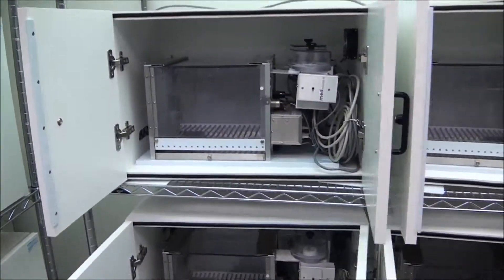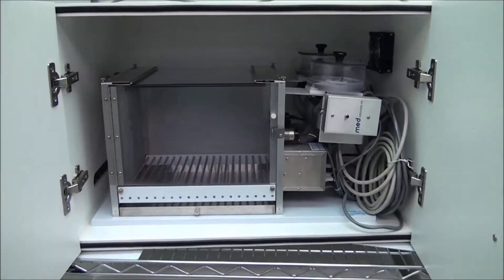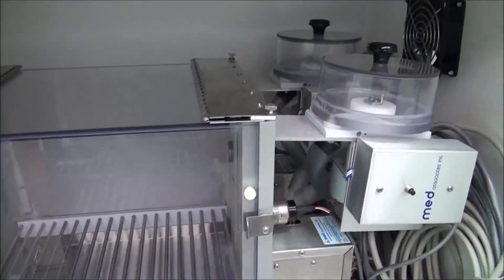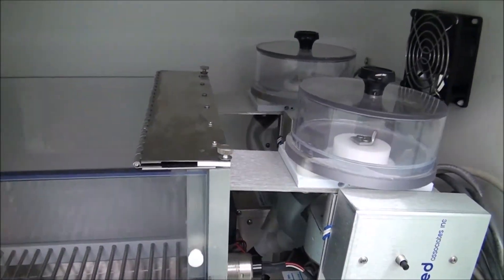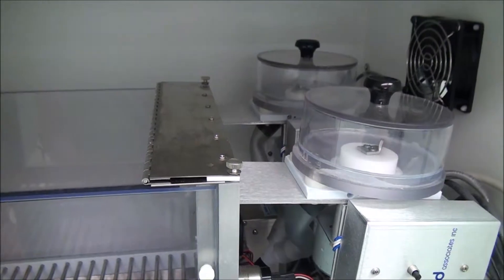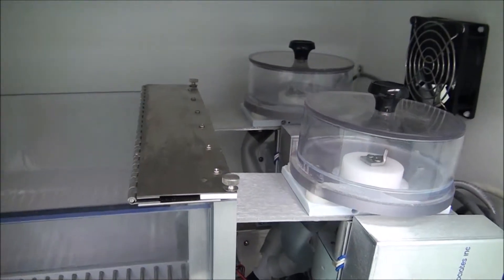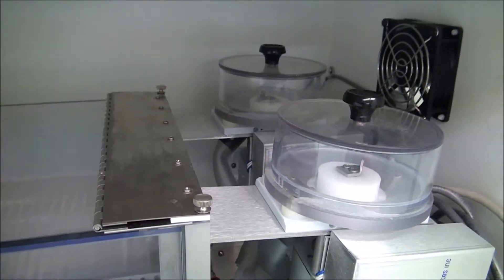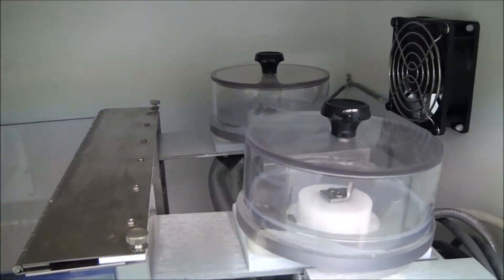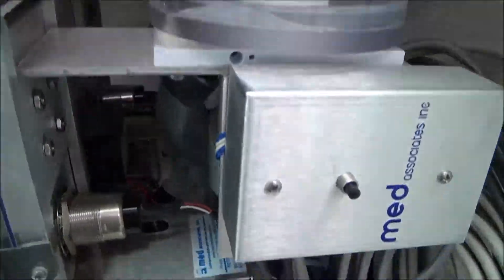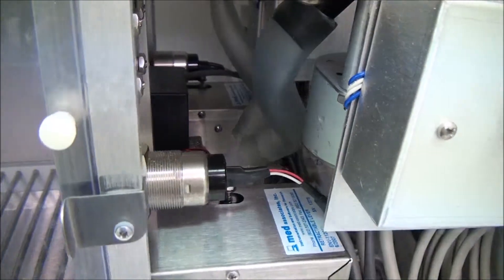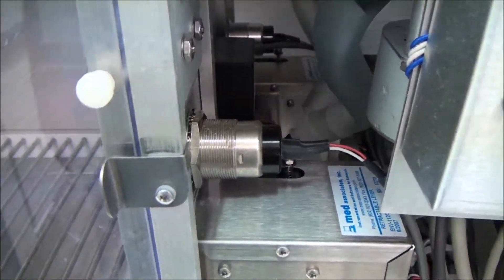We're going to move up. These are all identical, so the one I'm showing you here will be the same in all 16. You can see it has two pellet feeders, and they both drop down to the same trough there with the Y-manifold. It has two stimulus lights in it.